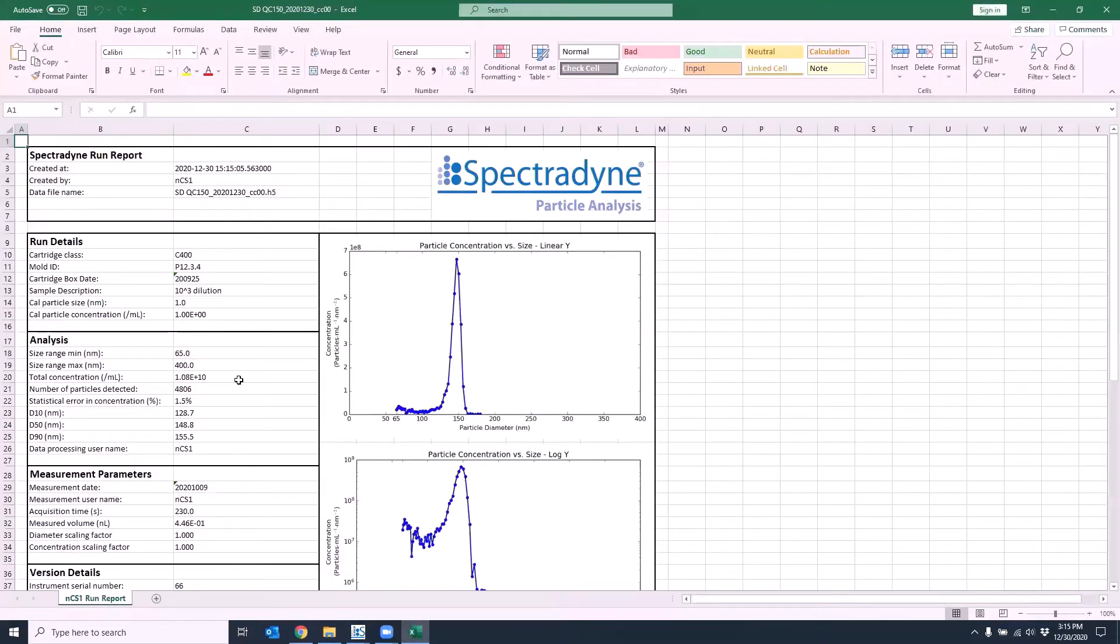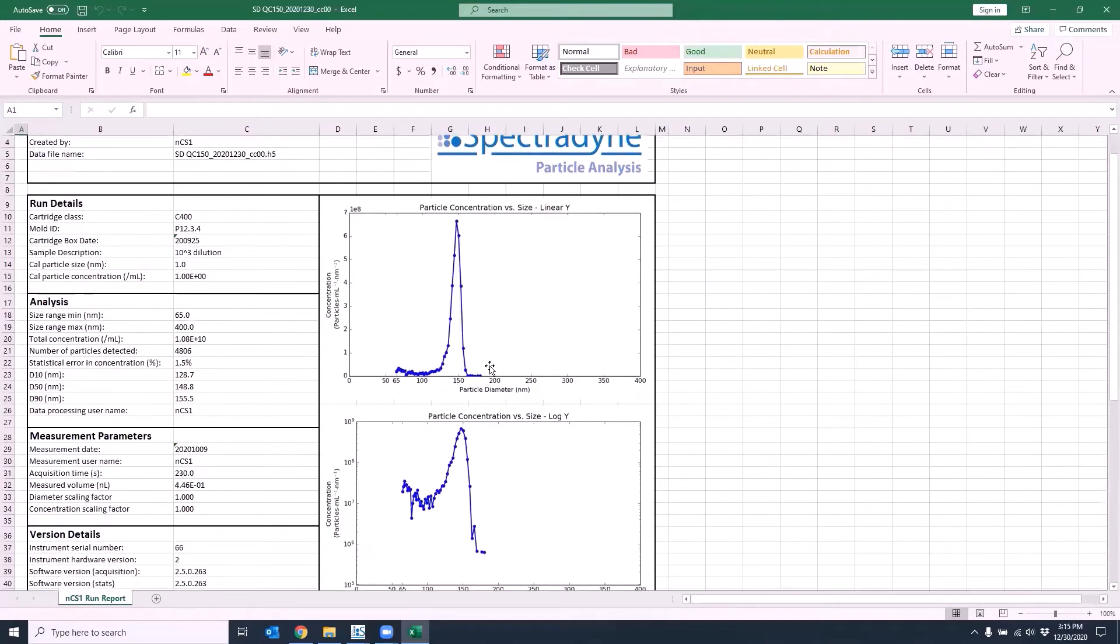The run report contains important run information, as well as size distribution plot and transit time scatter plot.